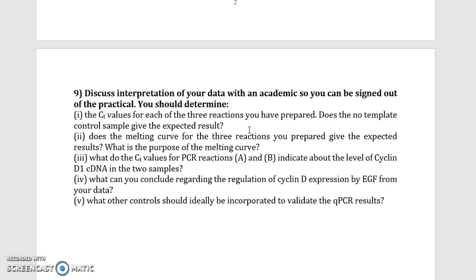What's interesting though is that for my practical, I actually got a Tm, a melting temperature. This is the melt point, where 50% of the DNA becomes single-stranded, and this is kind of strange because if there's no DNA present, then we shouldn't be getting a Tm value, but we did, so that's just sort of a spurious result. It's a questionable result. We're not quite sure why we got that.